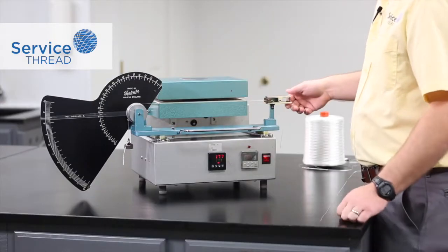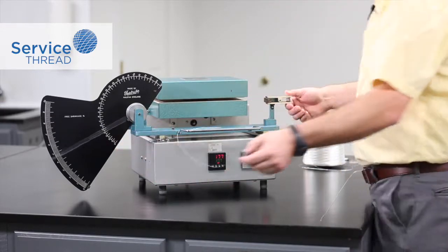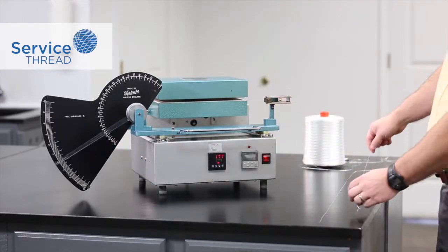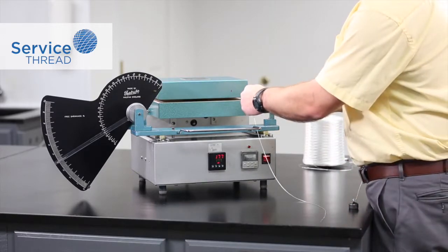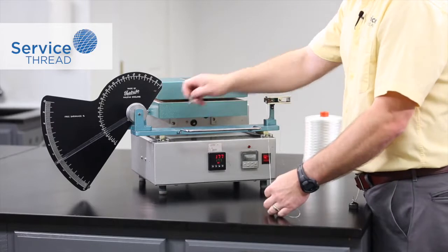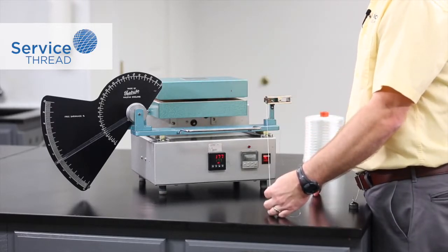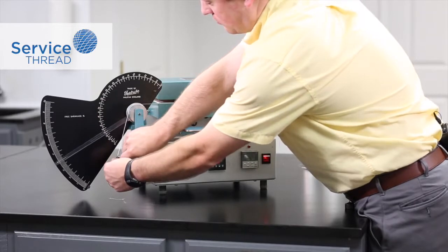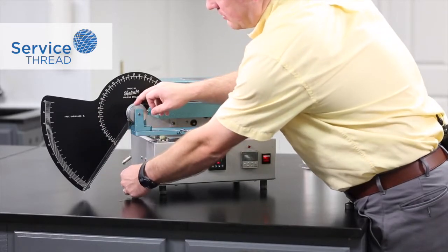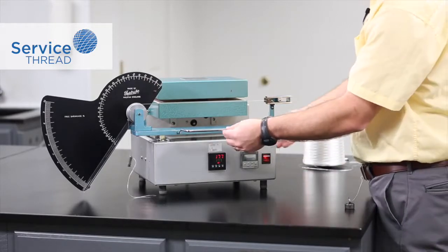Now, to demonstrate the difference that the pretension weight makes, we're going to do an example of the same material using a 9 gram weight. This is important because many raw material manufacturers specify a shrinkage method. When they do not specify a shrinkage method, or when we're testing finished goods, we always default to the ASTM method. So again, we have a sample with a 9 gram weight, 177 degrees for two minutes, and we'll start the test.